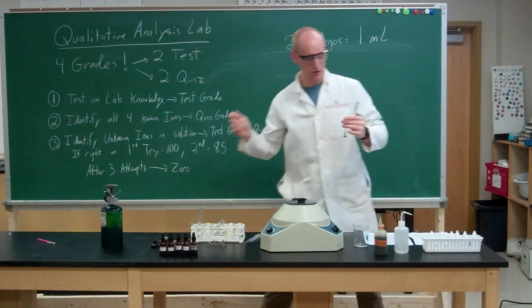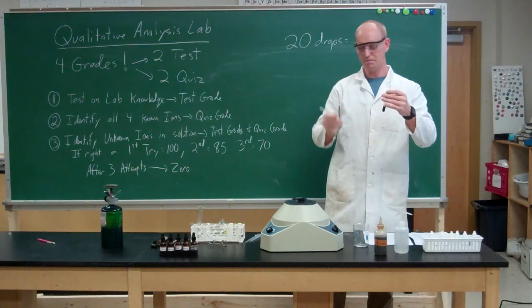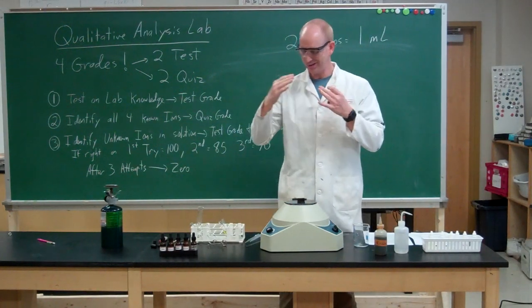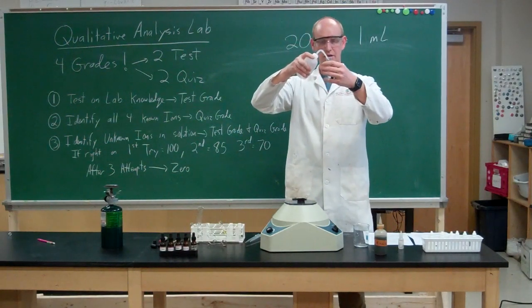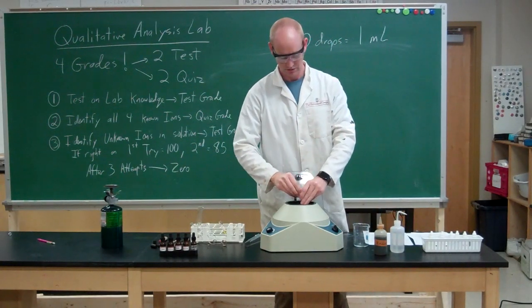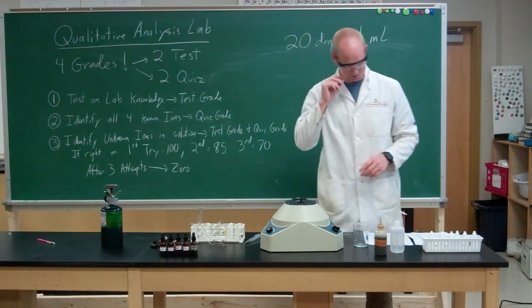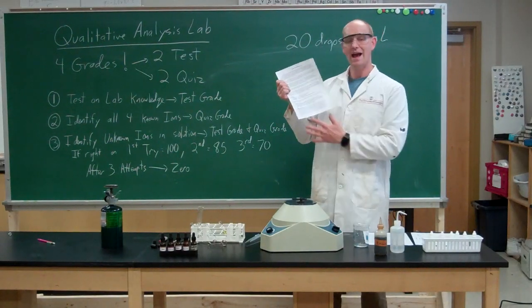And you get a stirring rod, and you mix it up. And then once you mix it up, again, that's made the solid go back into suspension, so recentrifuge. Do the counterbalance test tube, add some liquid to it, and back into centrifuge. Now, all of this that I've gone through is in this background paper here.